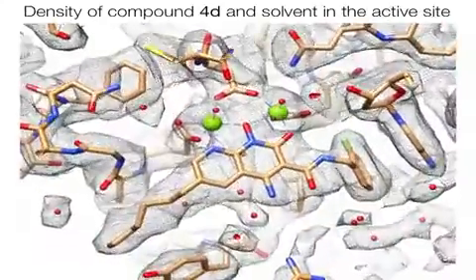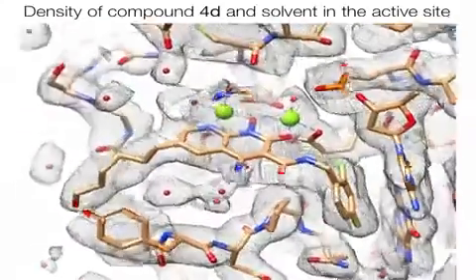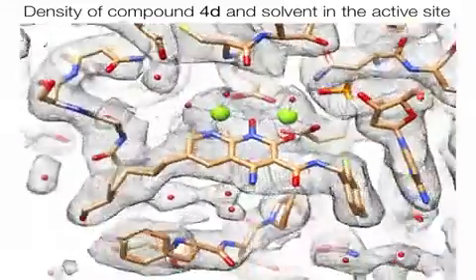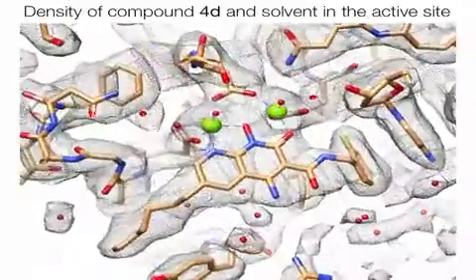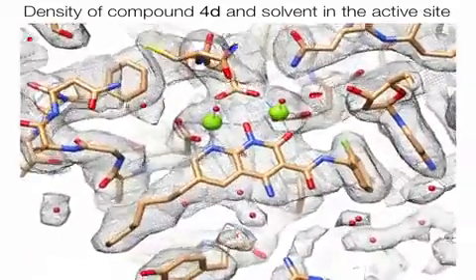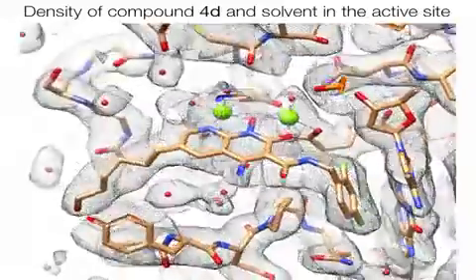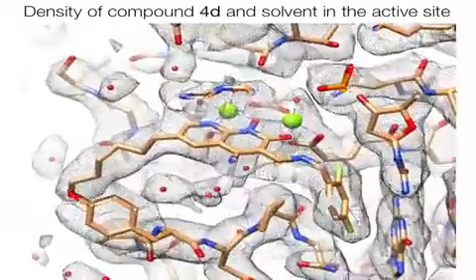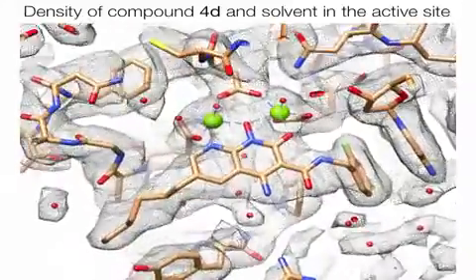Surrounding the ligand, you can see that there are lots of water molecules. There's about 10 of them that are evident in this movie, and more that are surrounding the active site. So these water molecules are critical. They're relevant to drug binding. They can be exploited, as I'll show in a later slide, for the purposes of drug design.